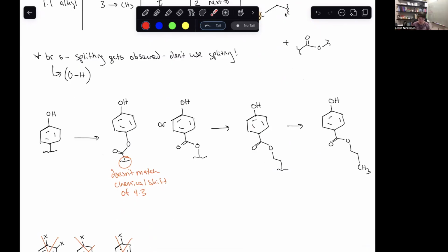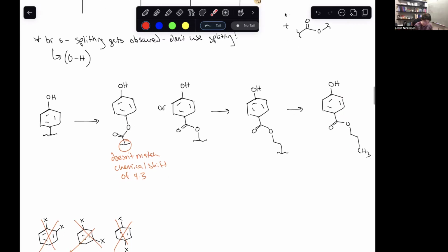I've got my 5 degrees of unsaturation: 1, 2, 3, 4, 5. I've got 1, 2, 3, 4, 5, 6, 7, 8, 9, 10 carbons. I've got 1, 2, 3 oxygens. I've got all of the pieces here. So once you have your guess, then you need to get into your check. It's really, really important that you go through and check to make sure that this data makes sense and that you didn't accidentally erase something and get rid of a connection point because you put together pieces that didn't have enough open spots in them.